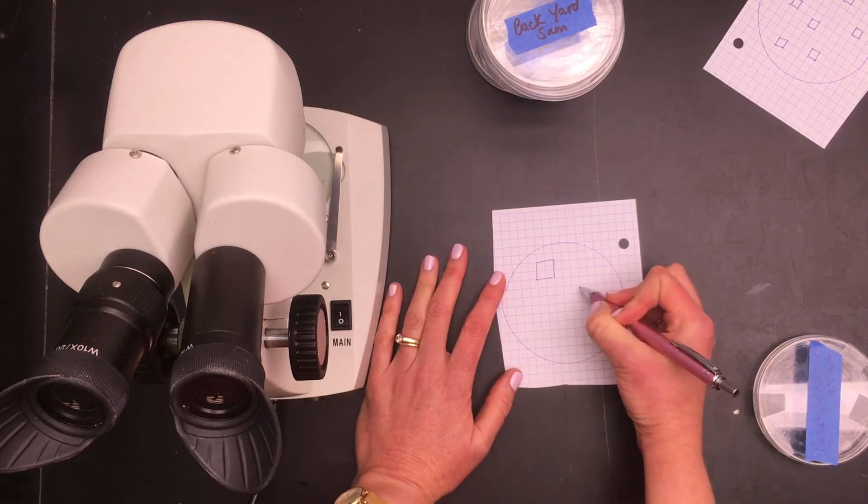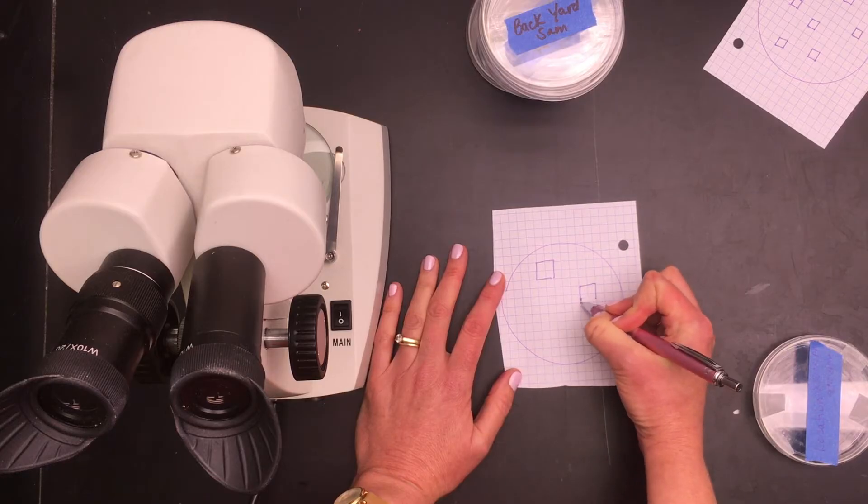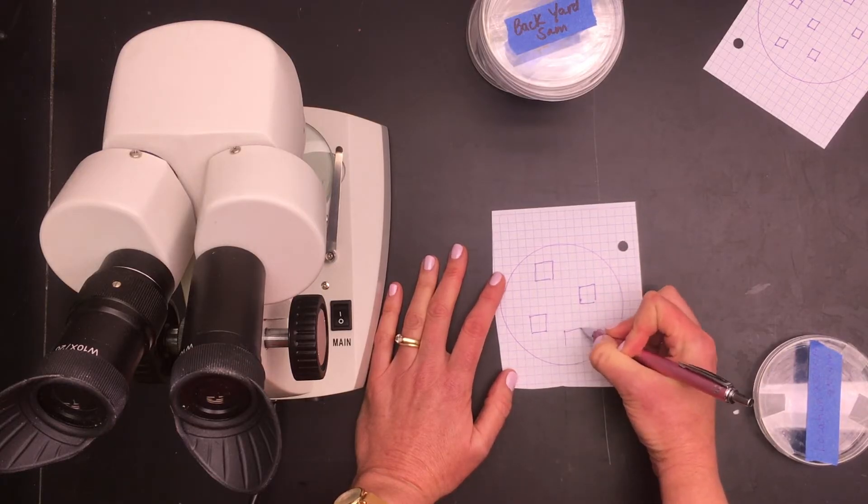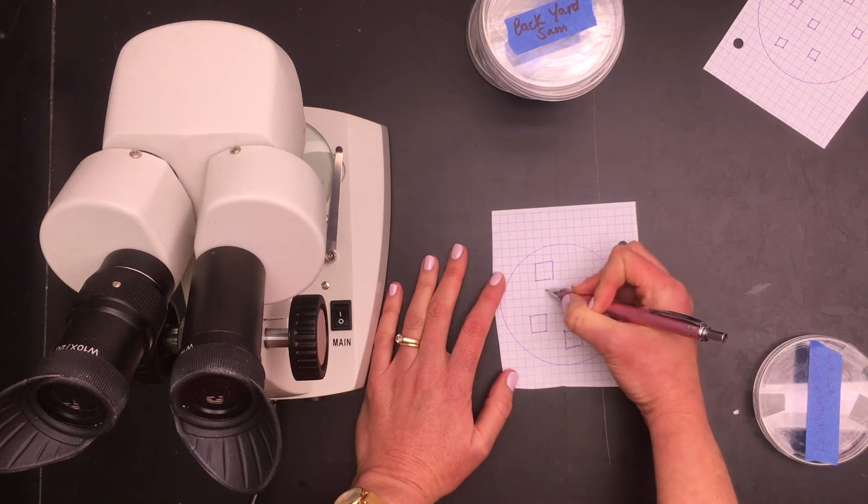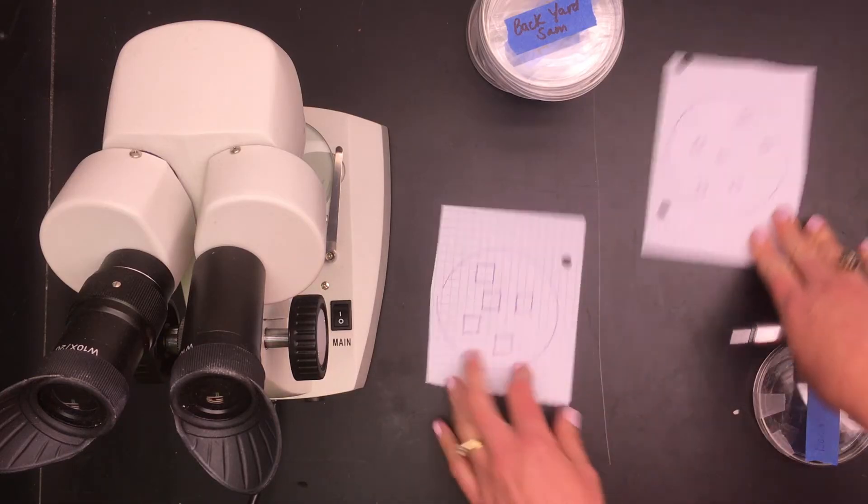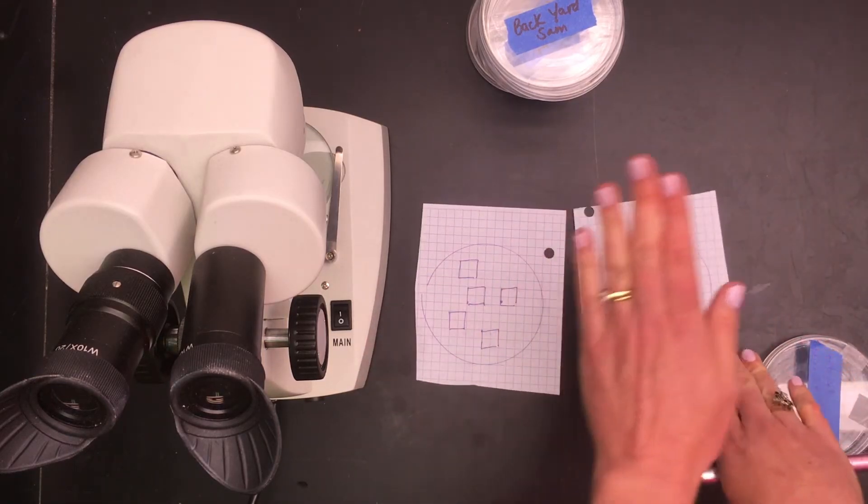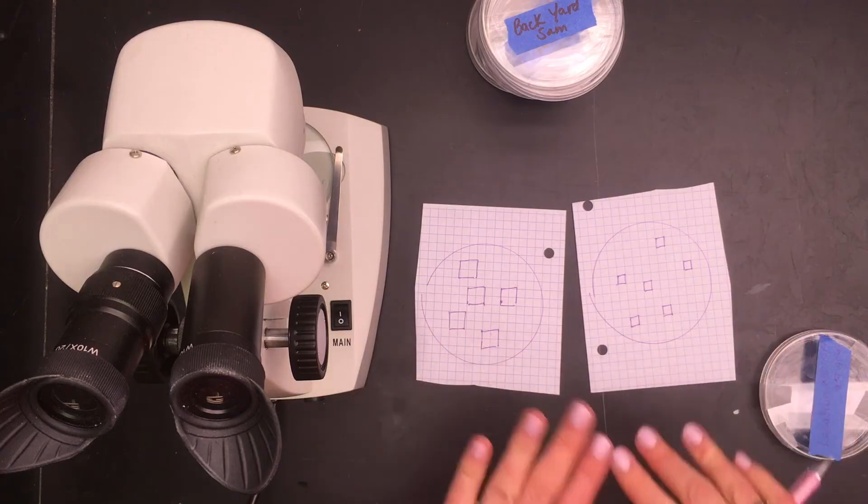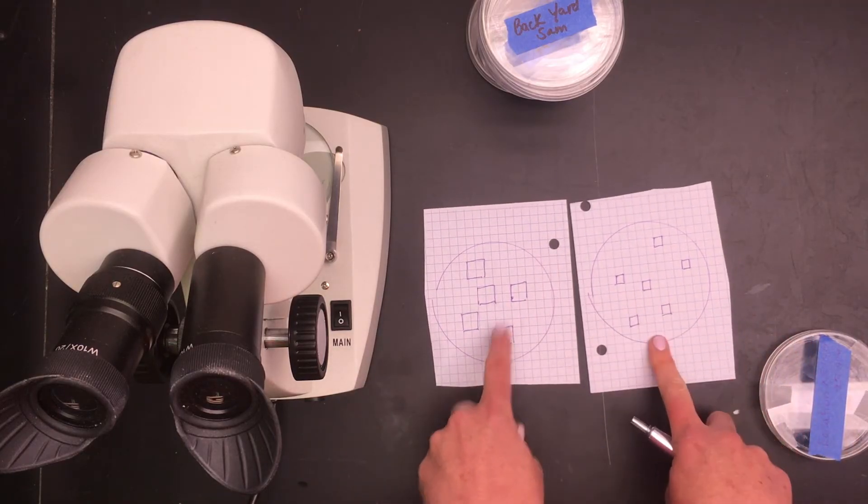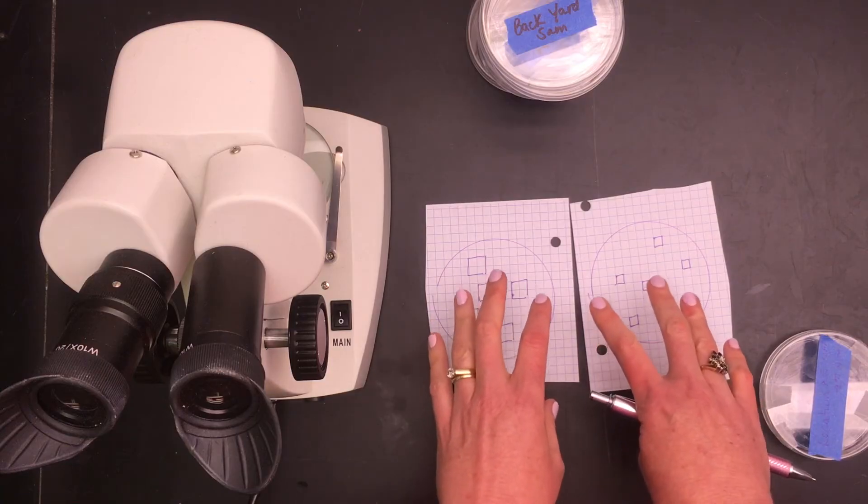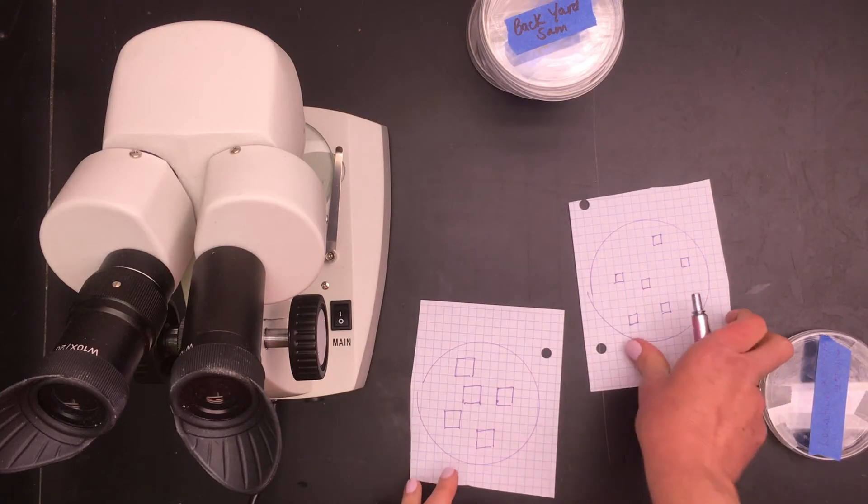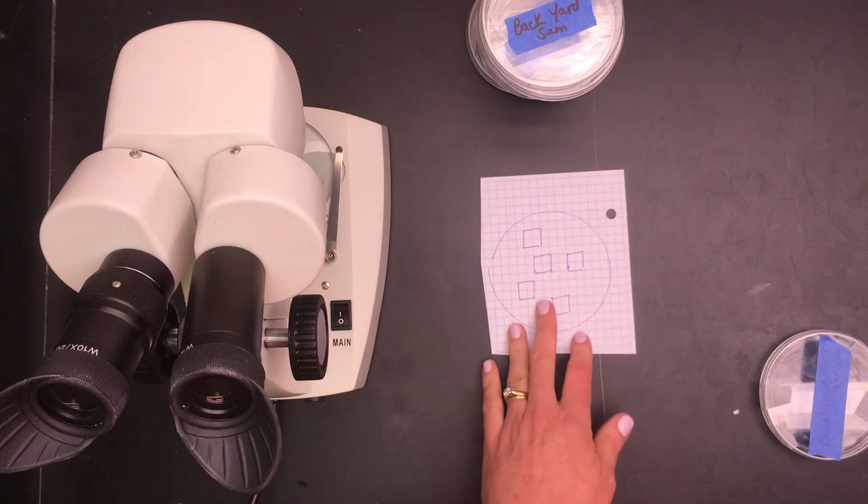But whatever you do, it has to be the same template for all of your dishes. You cannot use this one on one dish and this one on another. That is not a constant. Your constant is that you have to choose and make one template and use it for all your dishes.